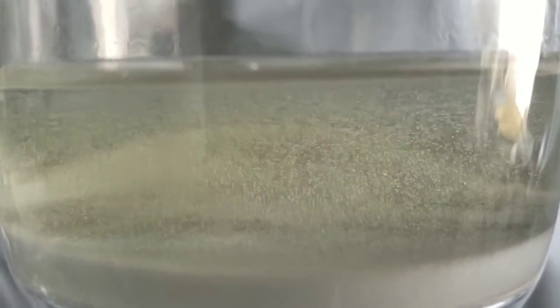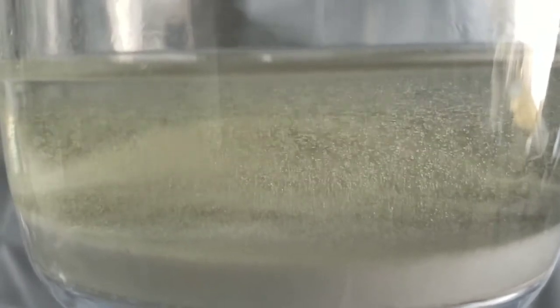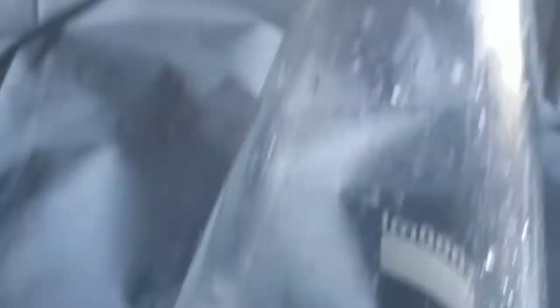With the way it bubbles, it kind of looks like a carbonated beverage, but I'd feel kind of sorry for anybody who gets a hold of it and drinks it — that would not end well for anyone.